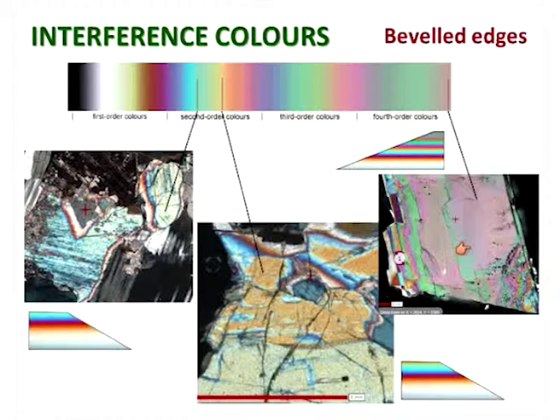Now, assigning order is very difficult, and that again is something that comes with practice partly, and it also helps if you have a good chart. I've seen some absolutely shocking charts on the internet when I was looking for a decent chart. This one is actually from the OU's online materials themselves. I looked at some and thought that bears no relationship to what the colors actually look like.